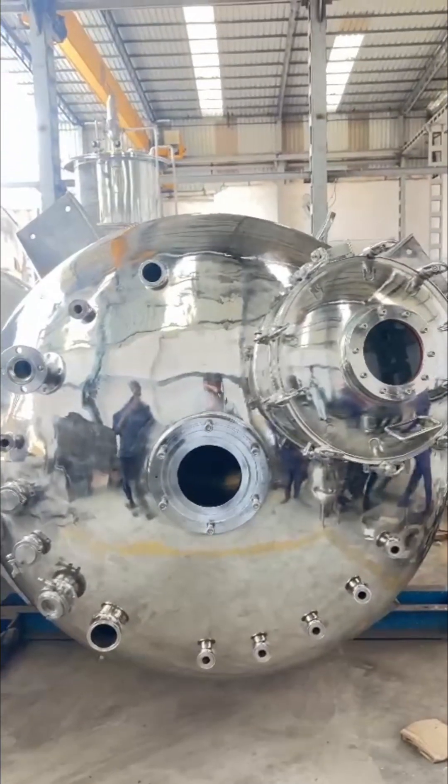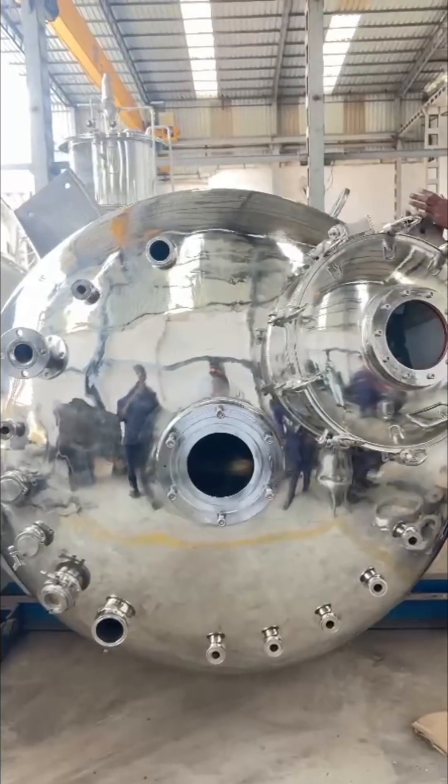The interior design features four internal baffles, ensuring optimal mixing and process efficiency.